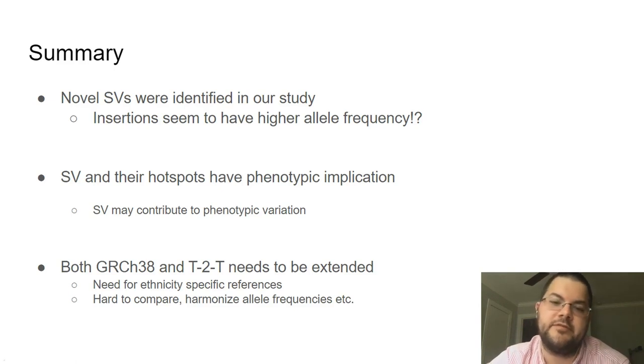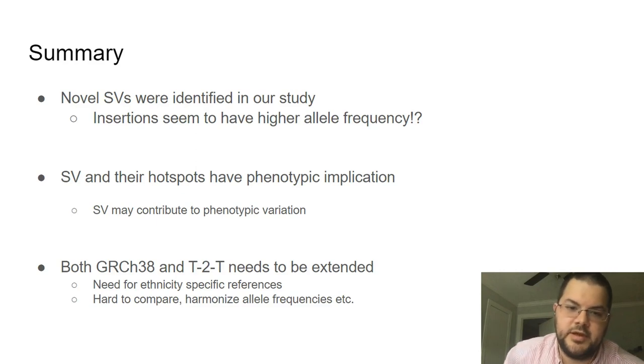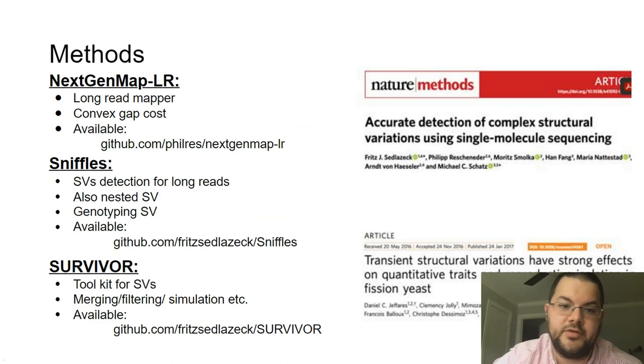Maybe that's not surprising, but using this data set we could really assemble contigs and therefore genomic locations that we can confidently assign to the human genome, that are either represented, for example, partially by the T2T consortium, or also by other genomes representing higher diversity of the human genomes and ethnicities. And some of them can actually also be placed in the hominid clade or different apes or different monkeys, indicating that despite having a long history of a high quality reference genome for humans, we still lack a lot of representation of different ethnicities in this reference.